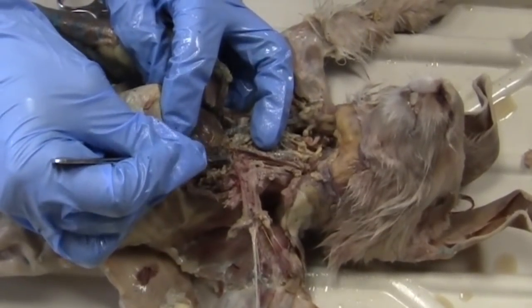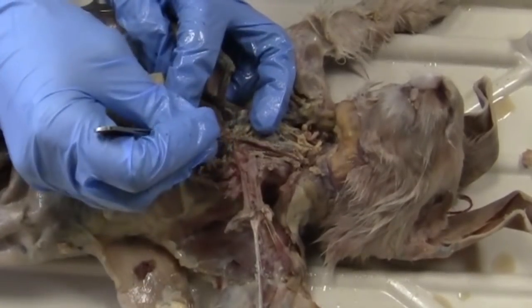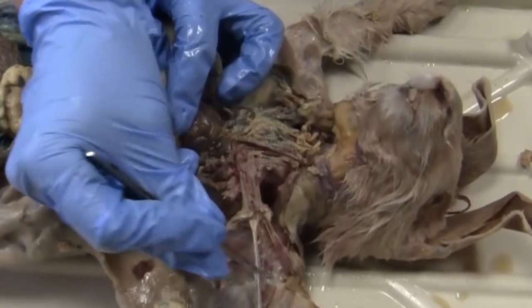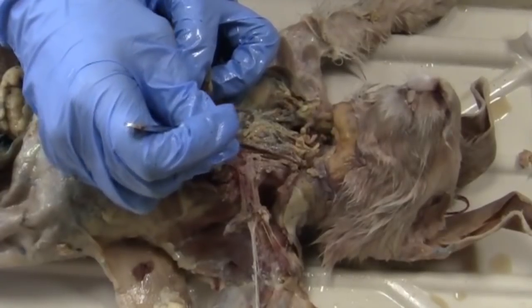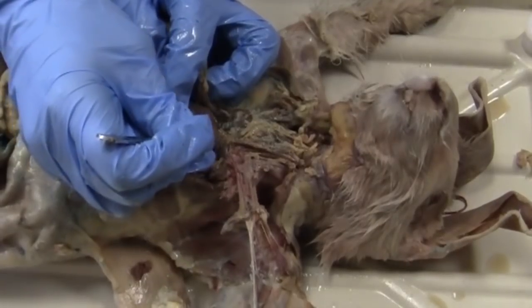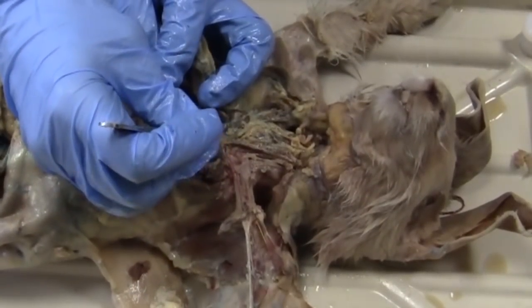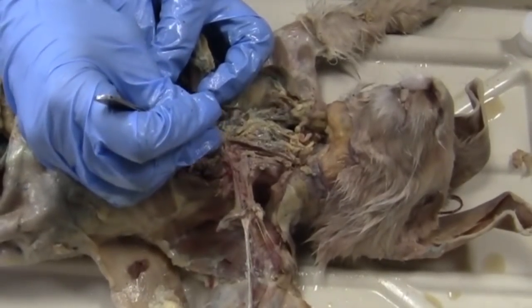That's the aortic arch. And coming off of that aortic arch, we have the brachiocephalic artery, which comes to the right side of the animal, and the left subclavian, which goes directly to the arm. So, aortic arch. Then coming this side, we have the brachiocephalic trunk, which is actually what is before it branches. So just a term, and then that's right here at the bottom part.